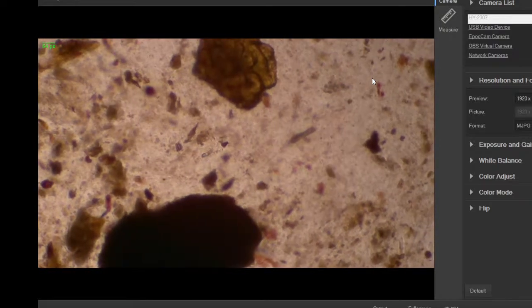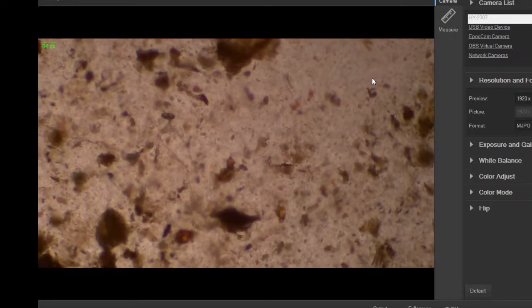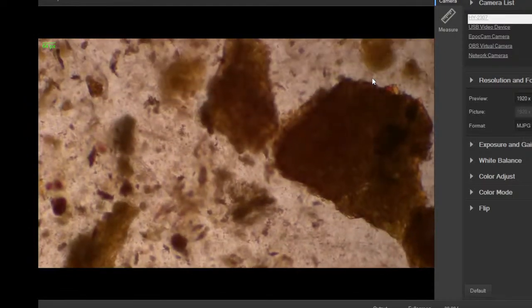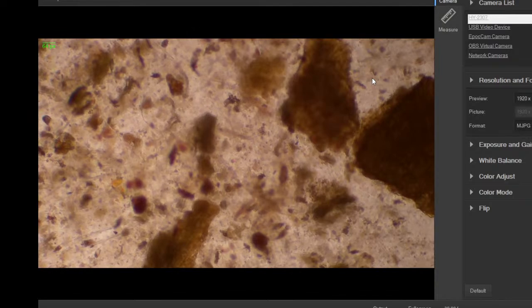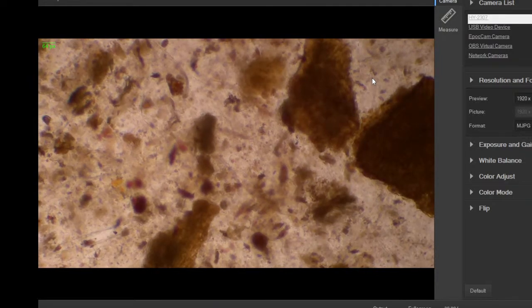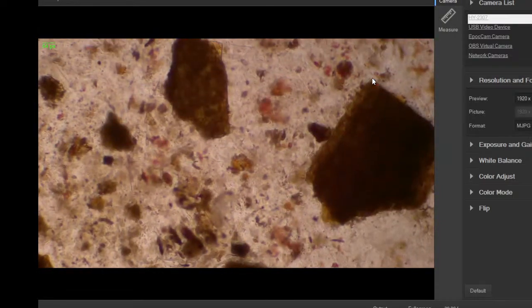So you can see chunks of tomato, chunks of chili, little particles dancing around as a gradient sort themselves out. Almost like blood flow there a little bit. So yeah, lots of colors.